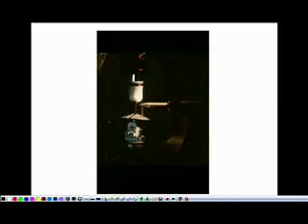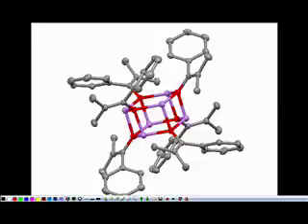Now, X-ray crystallography is not just for organic molecules, but it gives you something like this, the exact structure. This is one from an undergraduate research student that worked with me. These are the organic parts. You can see there are 6-membered rings. Those are benzene rings. And then you've got a carbon-carbon double bond here because you can see the molecule's planar. And then there are some oxygens. There are actually lithiums in here. But you can get the exact 3-dimensional structure and the exact structure of the molecule from X-ray crystallography.